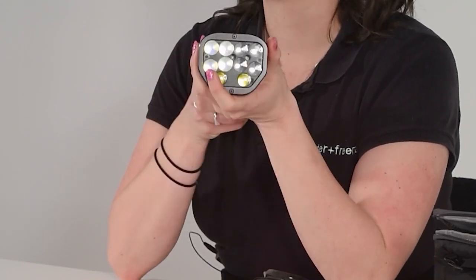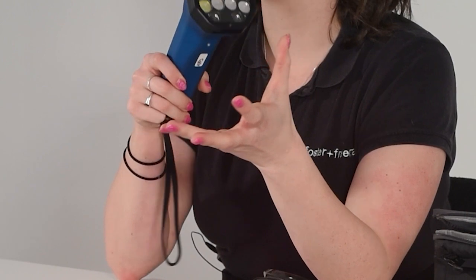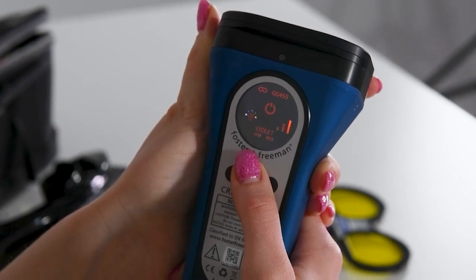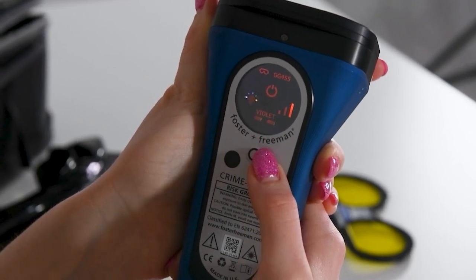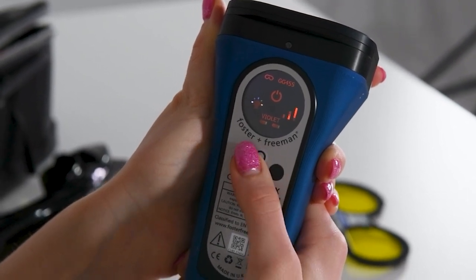Having those five light sources within one handheld unit means that the examiner can quickly switch between these light sources. When switching between light sources, the Crimelight will alert the user to which goggles should be used alongside that light source.